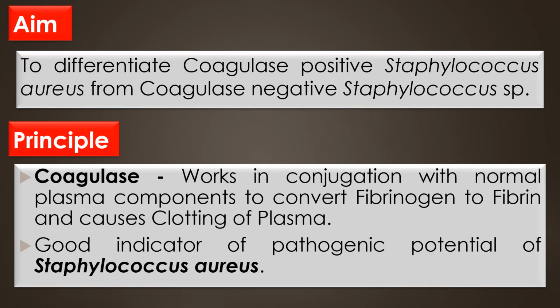Aim. The aim of the Coagulase test is to differentiate Coagulase positive Staphylococcus aureus from other Coagulase negative Staphylococcus species like Staphylococcus epidermidis and Staphylococcus saprophyticus.